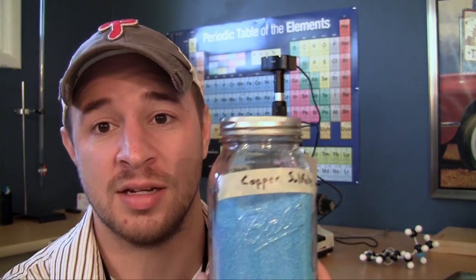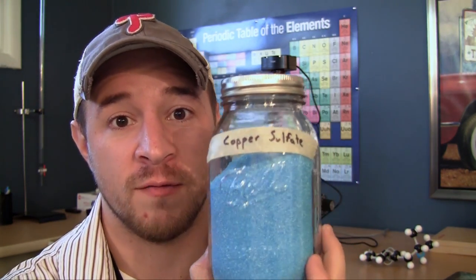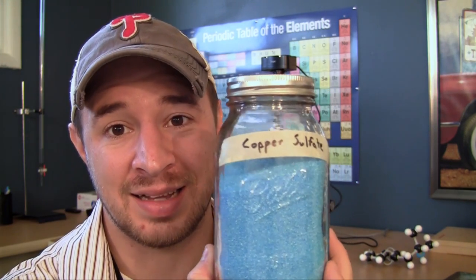Now the last thing I want to mention before I let you guys go is be careful whenever you're storing concentrated acids or very concentrated bases because concentrated bases like sodium hydroxide or potassium hydroxide they can actually eat through glass. So make sure that you don't store very concentrated bases in glass containers.